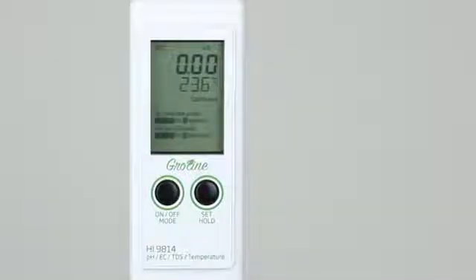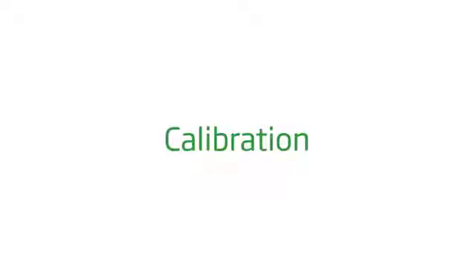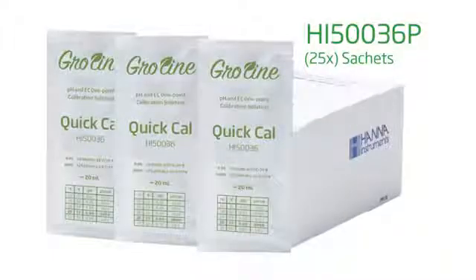Now that the meter is set up to your preferences, the next thing to do is calibrate the probe. We will be performing a quick calibration using the HI50036P quick calibration solution.